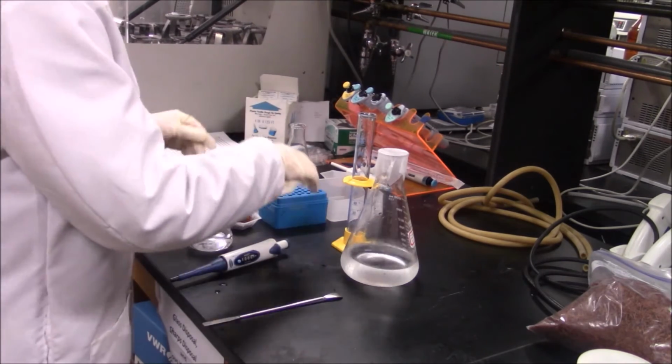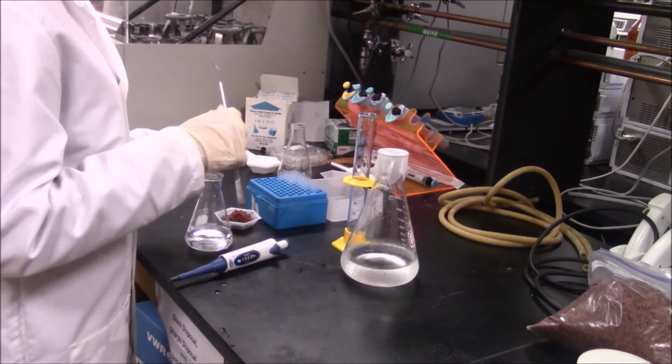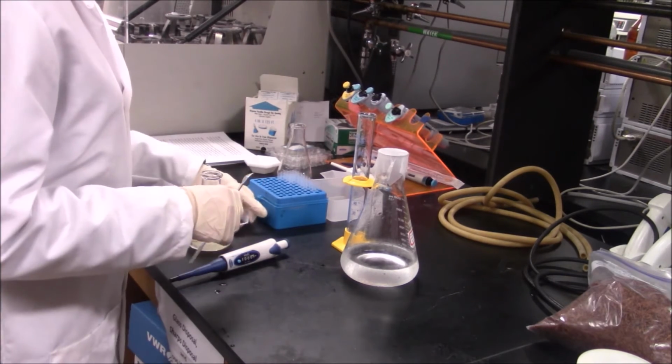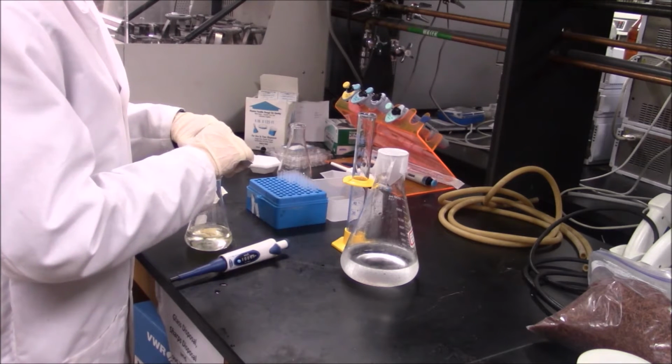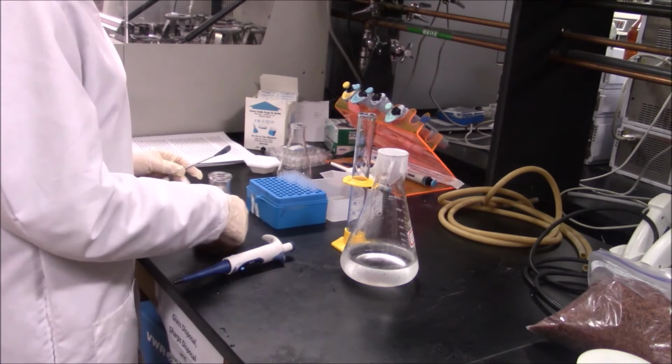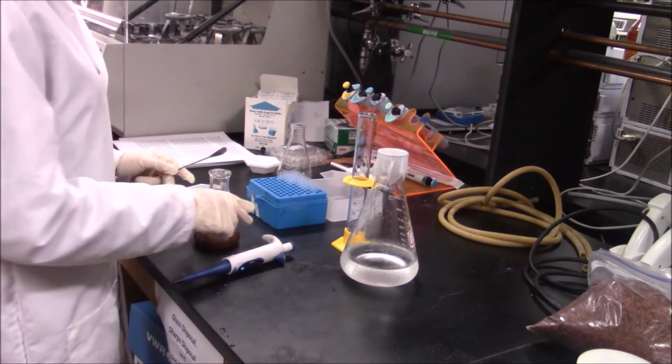Using the scale, measure out 1 gram of yeast extract and 10 grams of pre-treated aspen wood chips. Remember to zero the scale after placing the weighing dish on it, so as not to include the mass of the container in your measurements. Place the yeast extract and wood chips into the 250 milliliter flask.